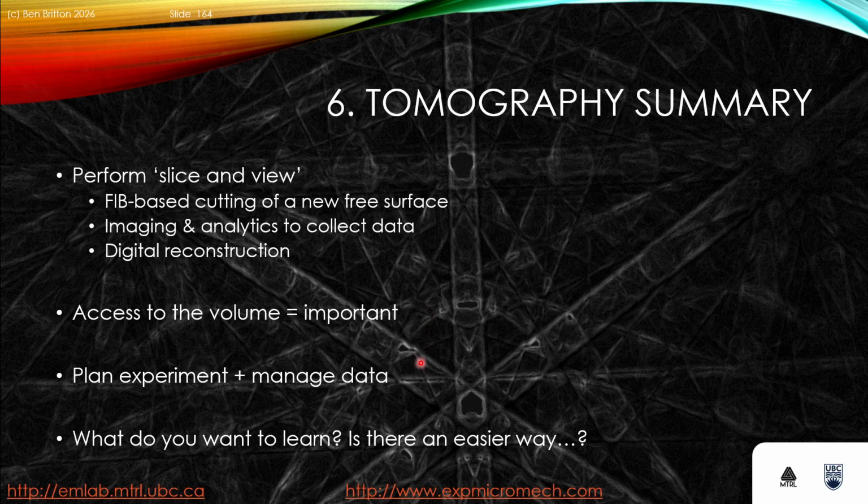And what's not to be underrepresented in this is that a huge amount of planning and data management is important for this. And really, I have to say that these are beautiful micrographs that we've produced, but each of them is very expensive. And so here, one of the questions is, is there an easier way to get to the answer that you want? You might, for instance, have one 3D tomograph, or maybe a couple that really sell the argument afterwards. But you can get quite a lot of useful information from two-dimensional cross-sections or appropriate surface-based approaches for this.